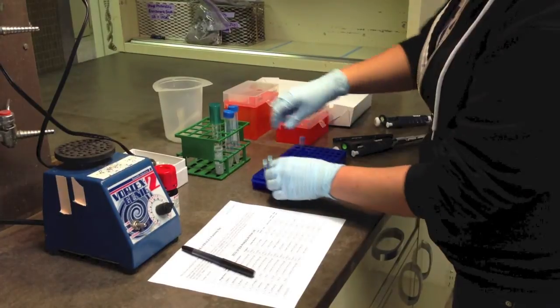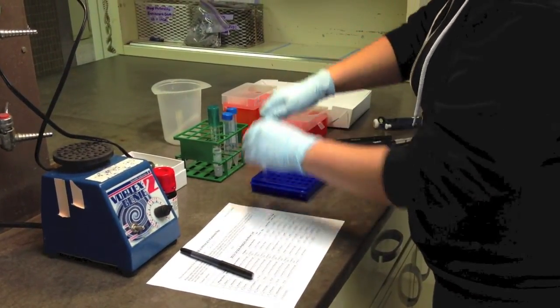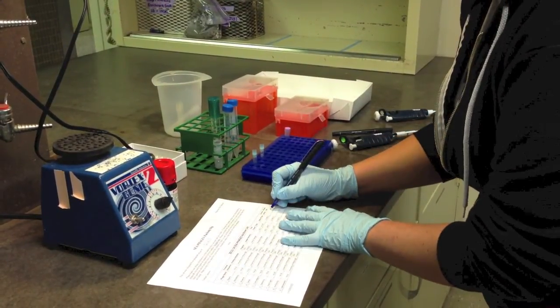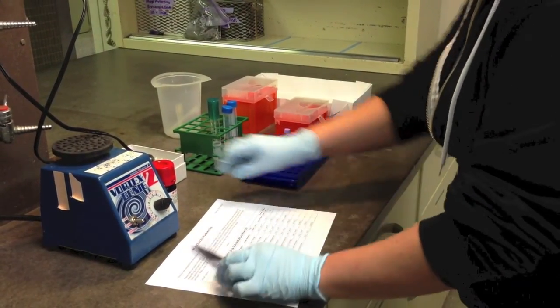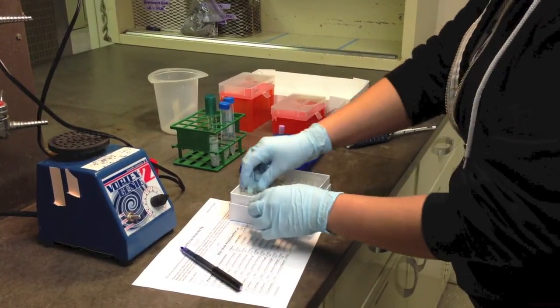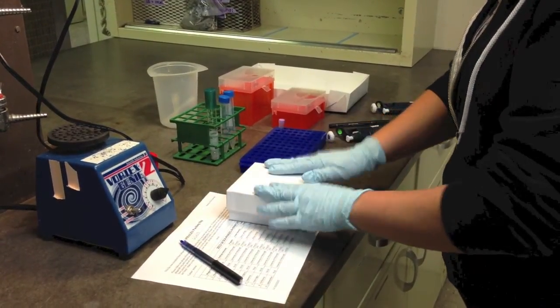As you finish archiving your samples, it is important to both make sure that your tube lids are secure and that your tubes are properly labeled. You should also be keeping track of which phages you have archived on your phage packing sheet. As you finish preparing your samples, you should place them into the provided box and mail them back to the University of Pittsburgh using the provided labels.